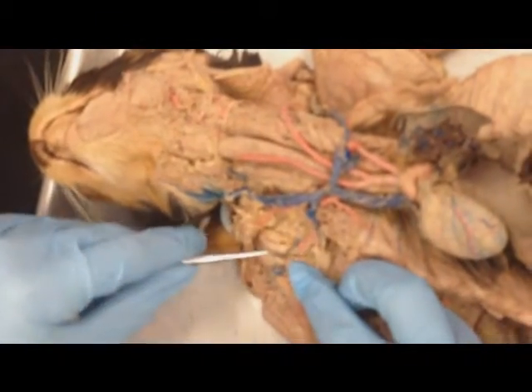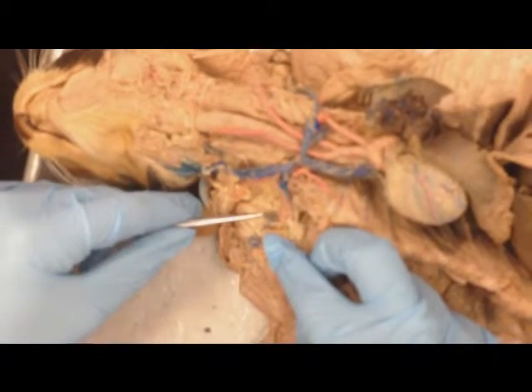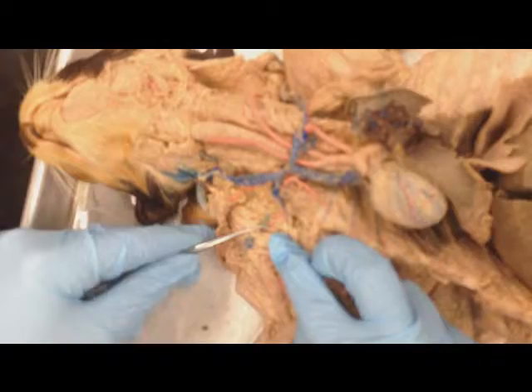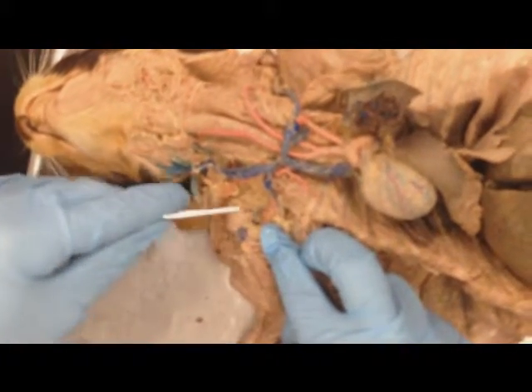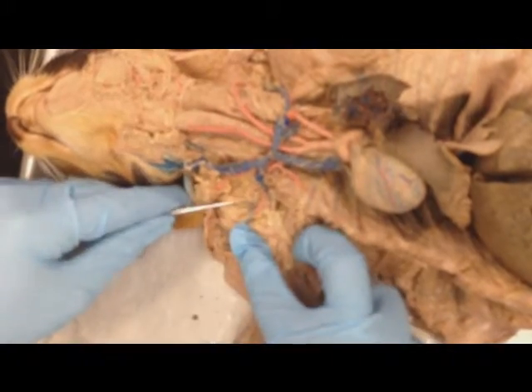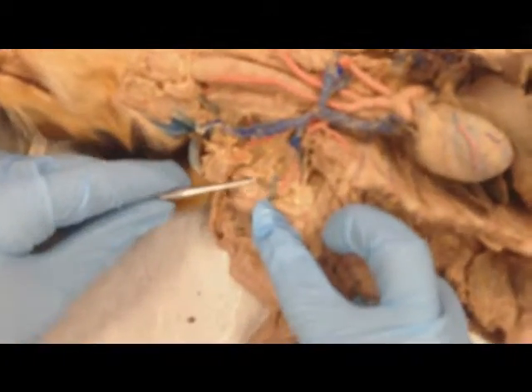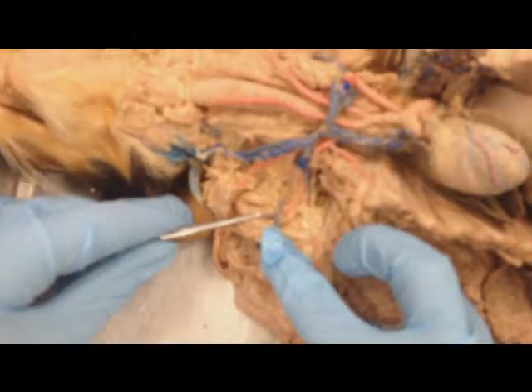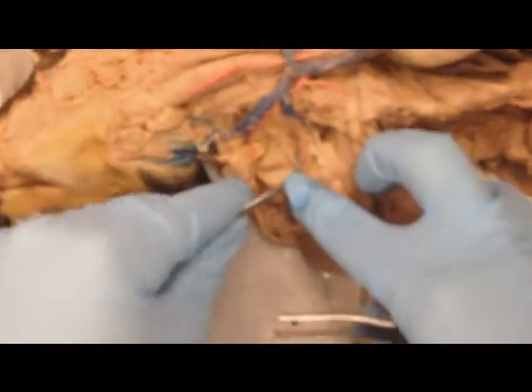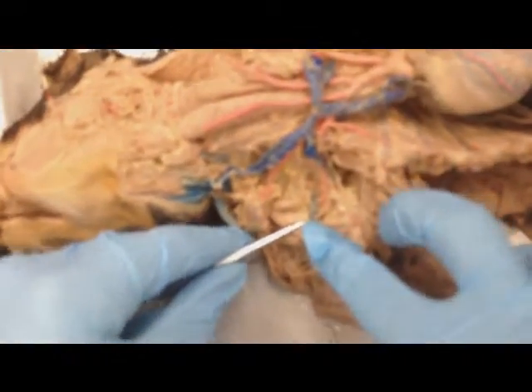You can see subscapular. If you dig in deep, a lot of cats you have to kind of dig in deep. You see these two small branches, 1, 2. You can point to that and say posterior humeral circumflex.